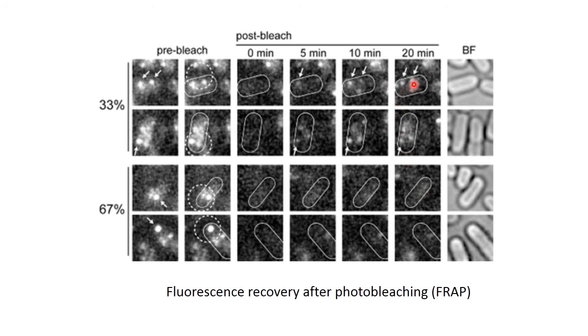So it shows that the proteins shown in this first case are highly mobile. The proteins can migrate in the membrane, they can diffuse and can recover fluorescence in this bleached area, as compared to the one shown later where we do not see any recovery of fluorescence. That means the proteins shown in this second case are almost fixed and they are not very much mobile.